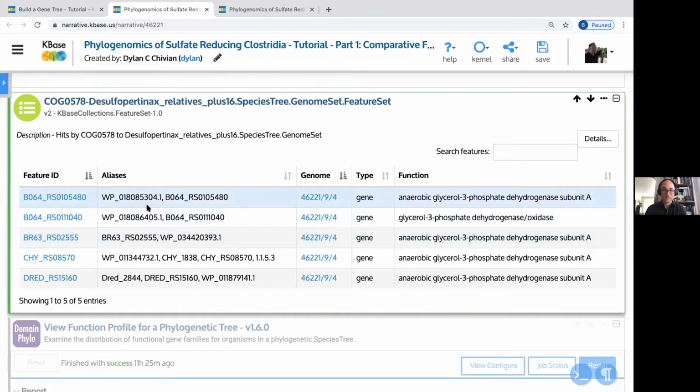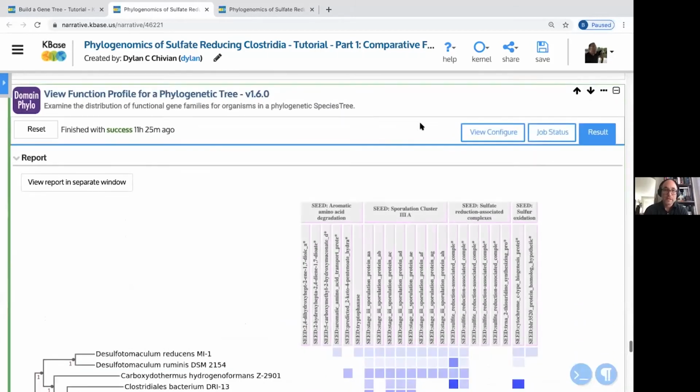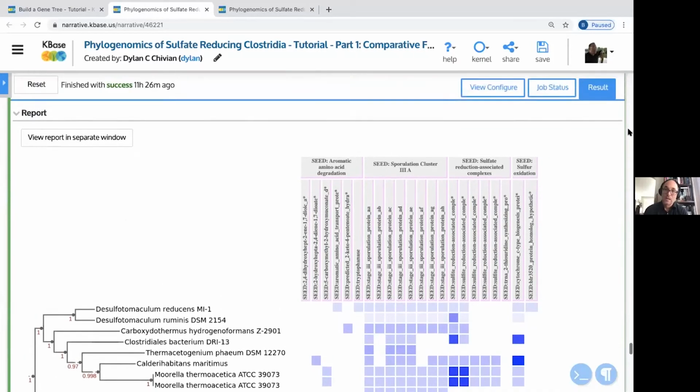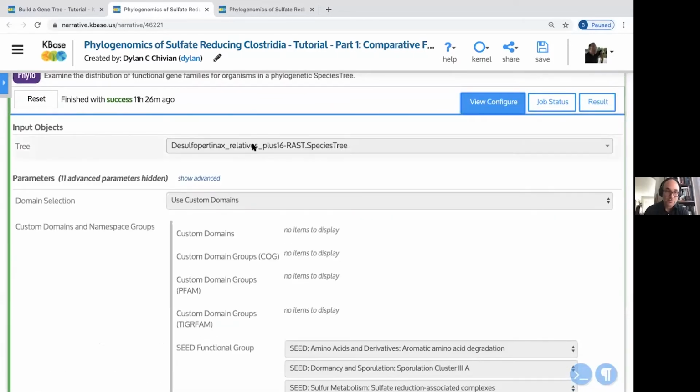And so we've got these different features, and we can browse them and so on. Additionally, we can put these into phylogenomic, or phylogenetic context, I should say, by combining a species tree with the annotation.